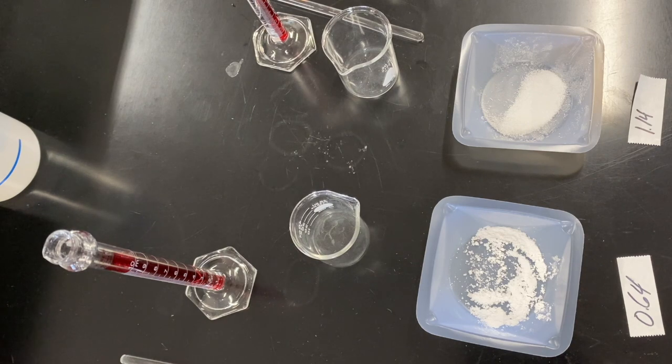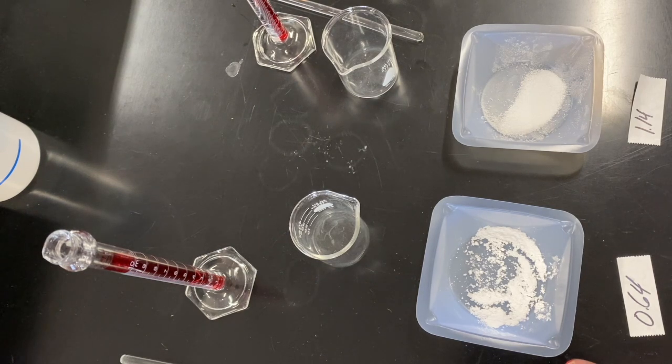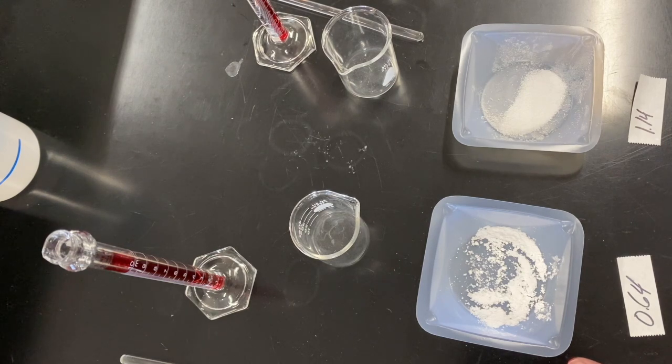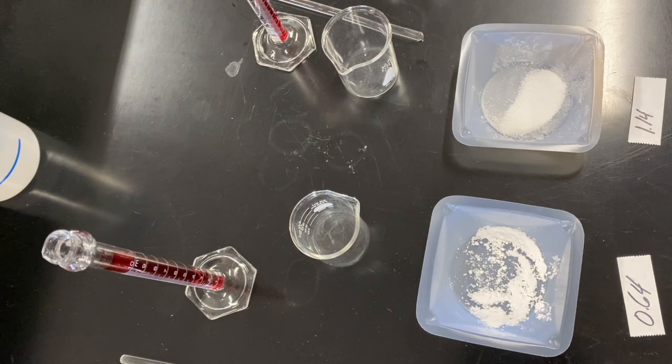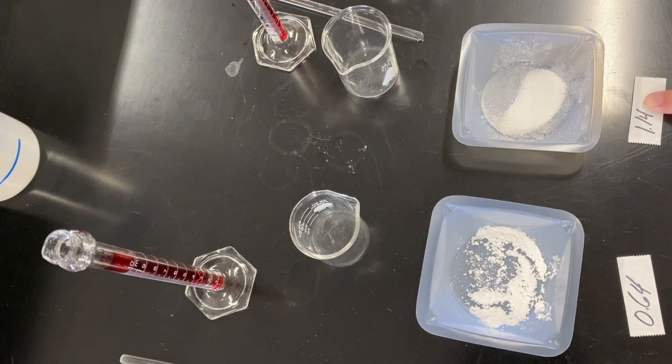So the first thing that we have is we have approximately 0.6 grams of magnesium sulfate. In fact, the actual mass is 0.64 grams. That's what I actually massed out. I also have approximately 1.1 grams of sodium carbonate. The actual mass is 1.14 grams.